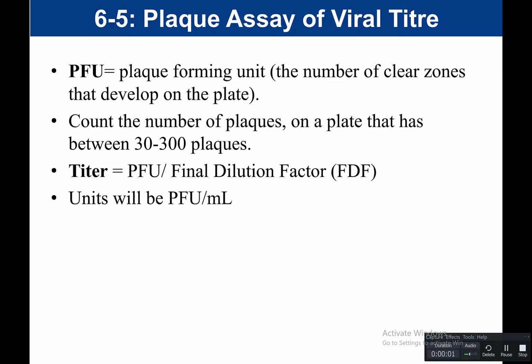So let's talk about how we calculate our titer. First we need to talk about PFUs. PFU stands for plaque forming units. It's the number of plaques that are found on the plate, meaning the number of clear zones. And remember that each plaque or clear zone on the plate represents one initial virus that was plated on that plate.